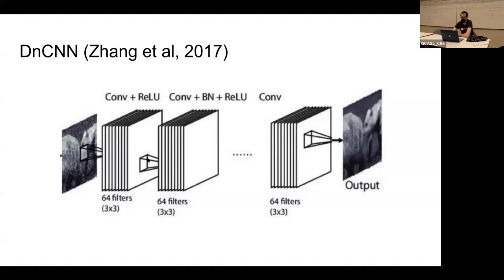You might be tempted to try to follow where the denoising is happening. It's maddening, you won't know. It's super complicated. You get 64 different images that get merged together, and 64 new images are made from that, and then they're merged together again. At every layer, the negative entries get set to zero. It's actually intractable to just look at it and make sense of it. But as we will see a little later, we can still analyze it in some ways to get some idea of what strategies the networks are using to denoise. Any questions about this?